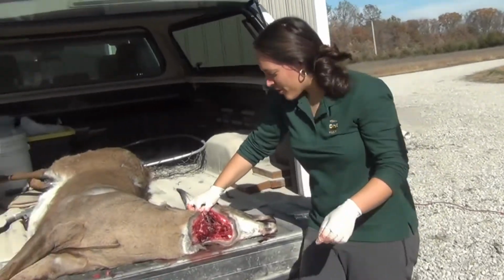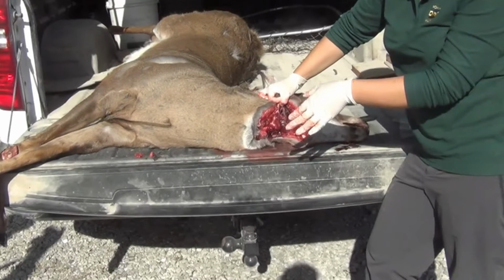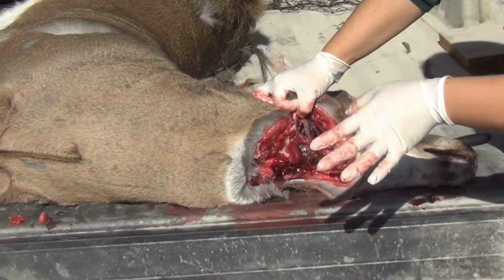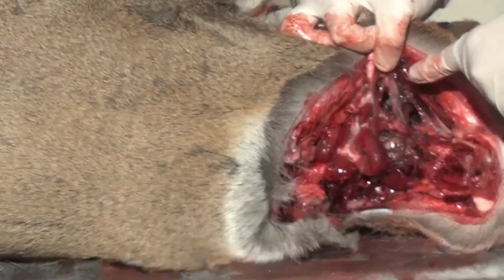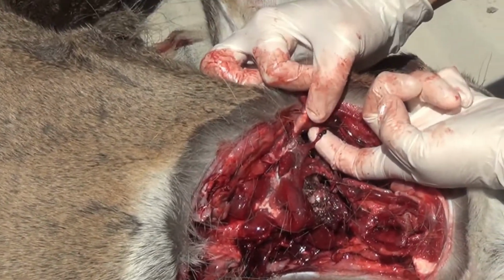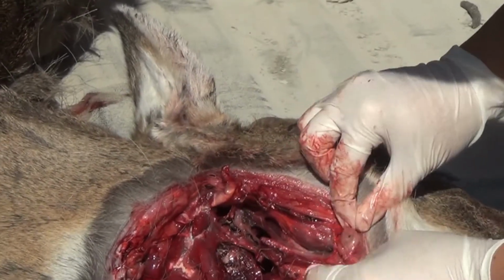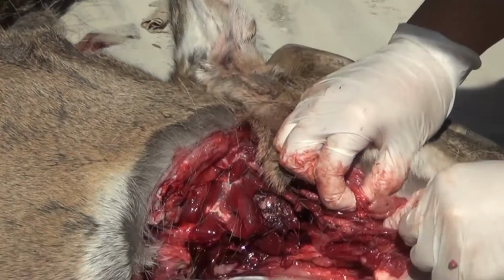I'll just point out another structure here. So again, this is a little sloppier than what we'd normally be dealing with in a hunter harvest. But you can see right here, there's kind of these two dark balls. People will call them blueberries. There's also some on this tissue right here.